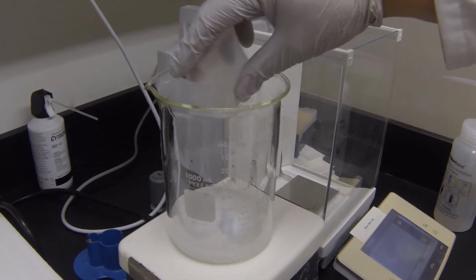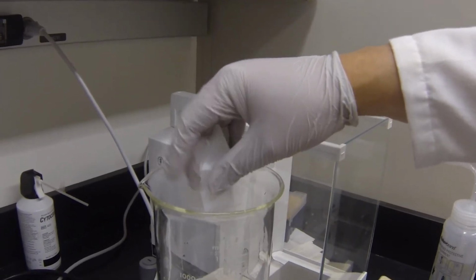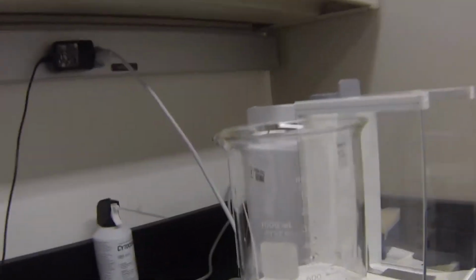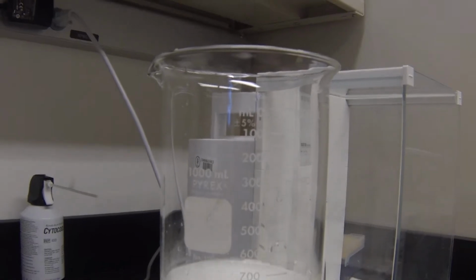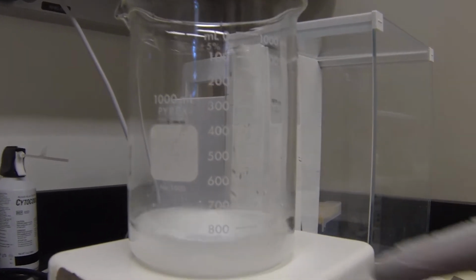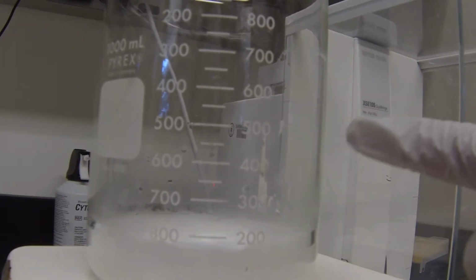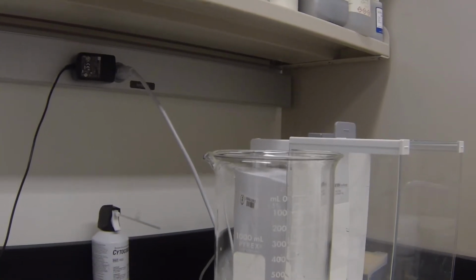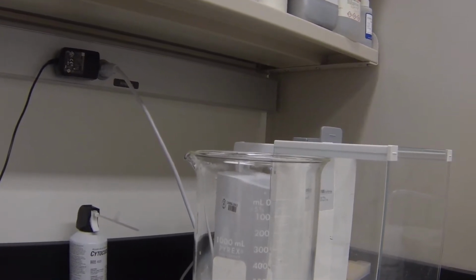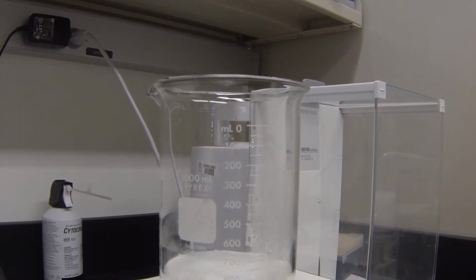You want to get all of it out, so I give it a little tap. As you see, our stir bar slows down a little bit, and that's because there's a little bit of stuff in there. As you see, it's dissolving, it's going into solution. It's actually exothermic, so you start to see a little bit of heat transpire.